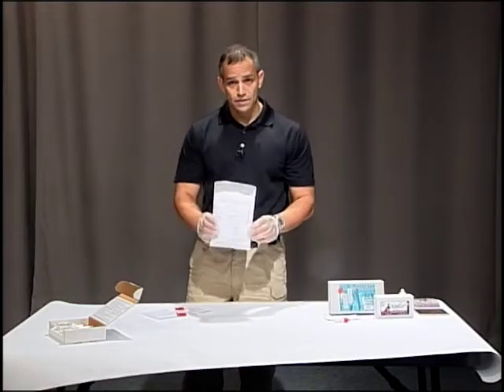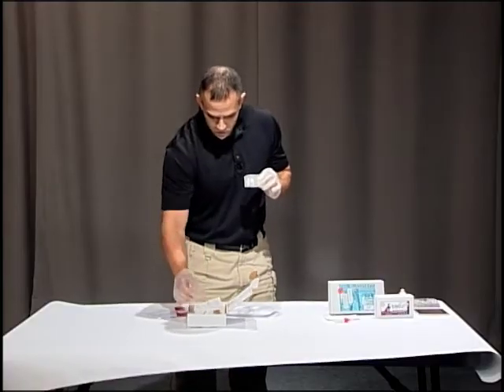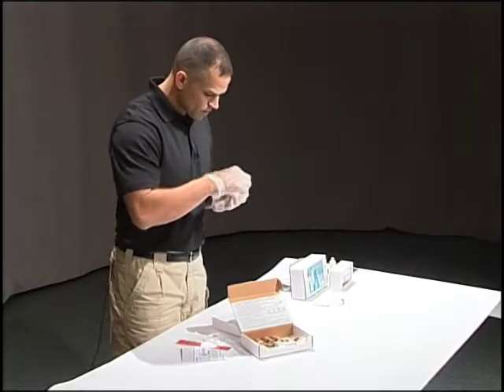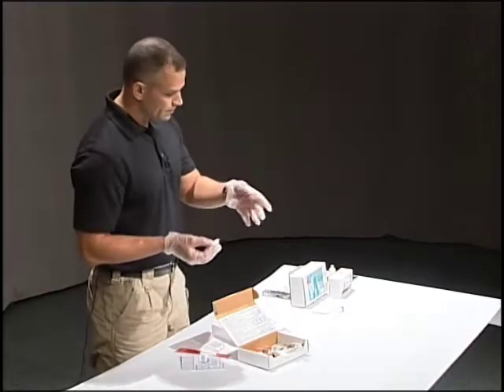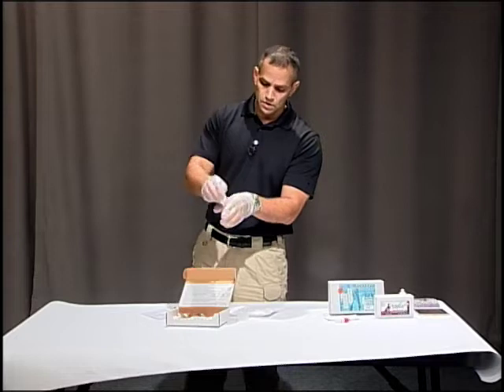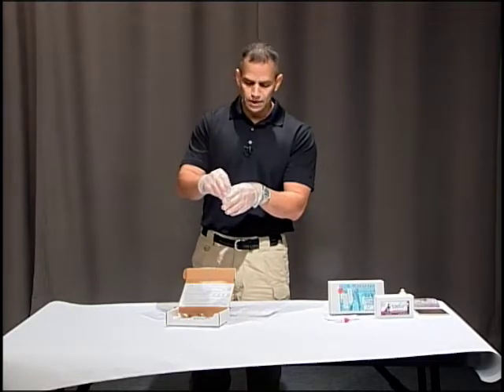Now that we've done our lab sample, we're going to do a presumptive test that we can do in the field using the two remaining pieces of the kit. Inside this magnified box is a cotton swab. If this were the dominant hand — where you think the person was holding the gun — you would swab their entire hand, really making sure you're getting the webbing of the hand.